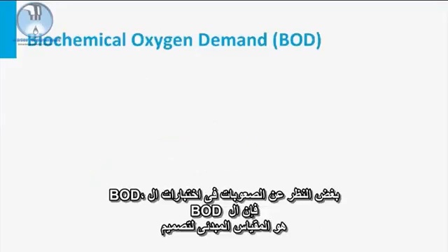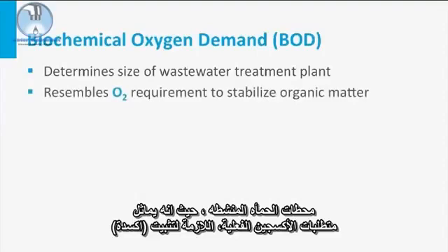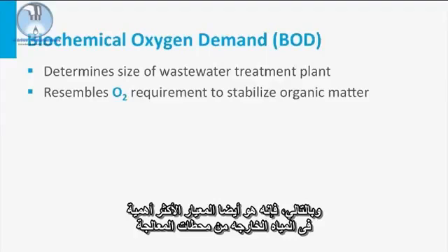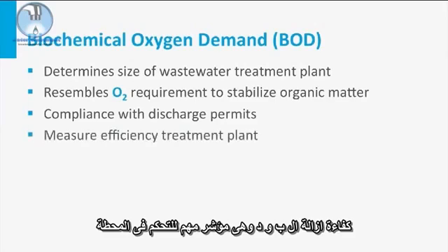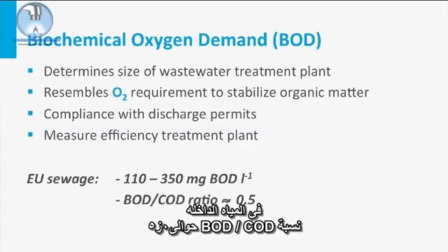Irrespective of the difficulties of the BOD test, BOD is a prime parameter for the design of activated sludge plants, since it resembles the actual oxygen requirement needed to stabilize the organic pollutants. Therefore, it is also the most important standard in the effluent of STPs. Moreover, by comparing the influent and effluent BOD value, the operator can calculate the BOD removal efficiency, an important plant control parameter. In European domestic sewage, the average BOD value is between 110 and 350 milligrams BOD per liter, whereas the BOD-COD ratio in the influent is about 0.5.